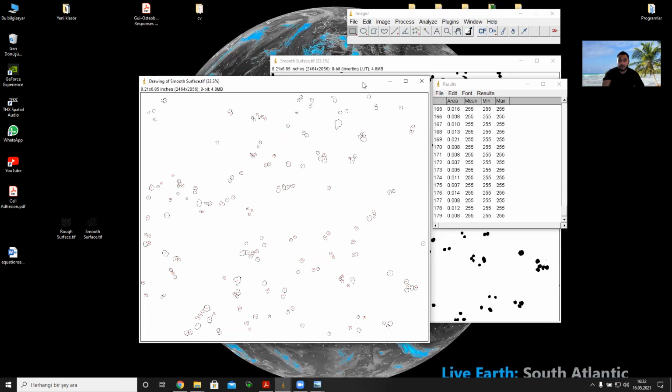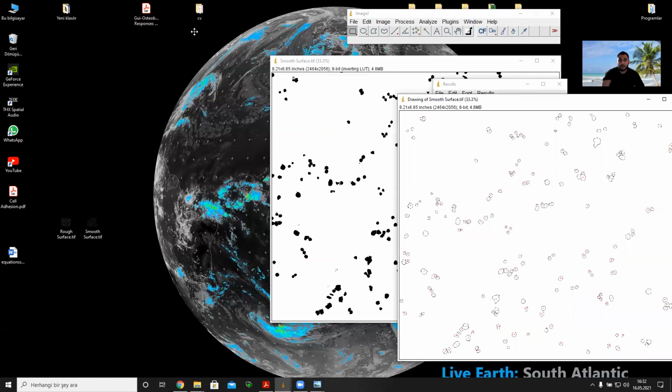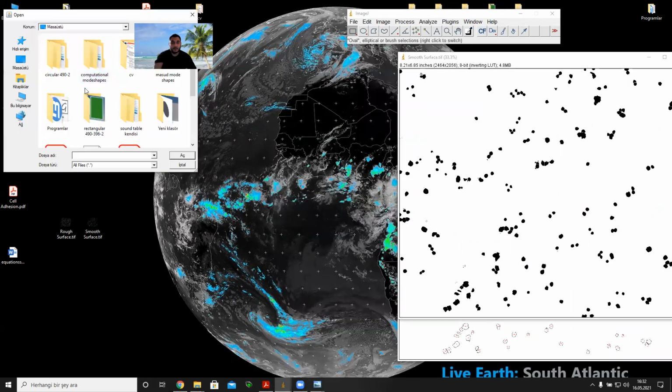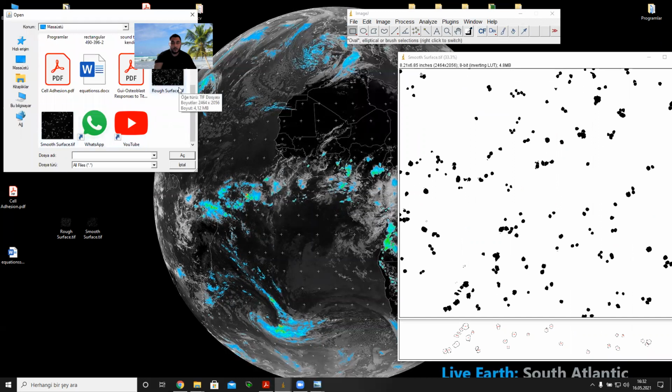Actually, for this surface that's enough. Let me stay in here for the smooth surface. And now I'm going to open the previous one, depending on the smooth.